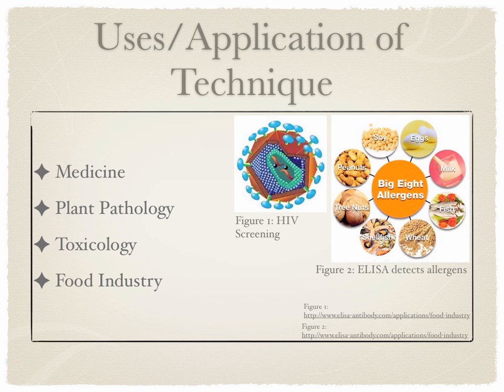The aim of ELISA as an immunochemical technique is to determine levels of specific antibodies or antigens in liquid samples. It has been useful in medicine. ELISA was the first test used to detect the presence of HIV and also diagnose the West Nile virus. It can be used also in plant pathology to detect plant diseases and also in the food industry.